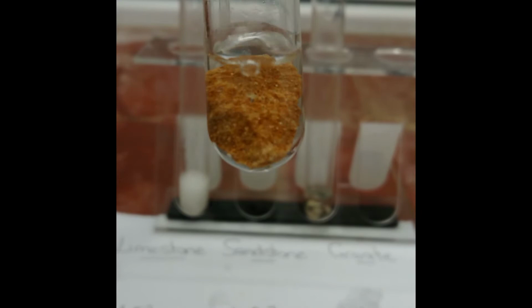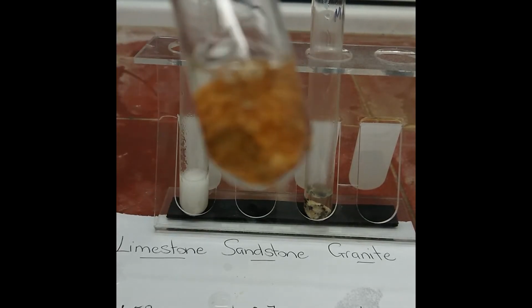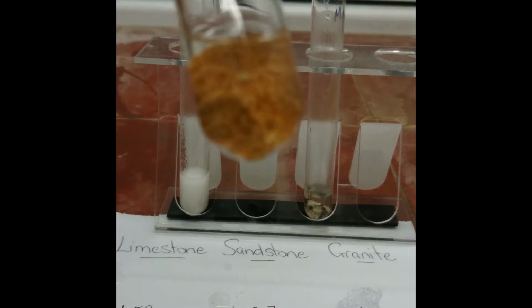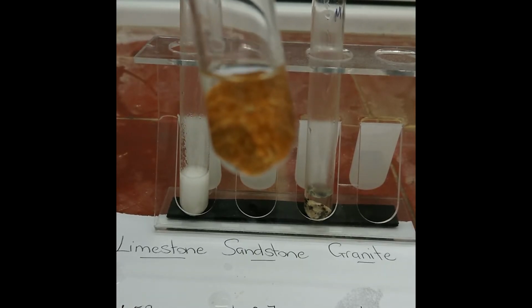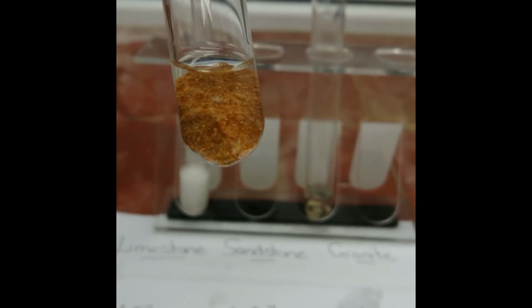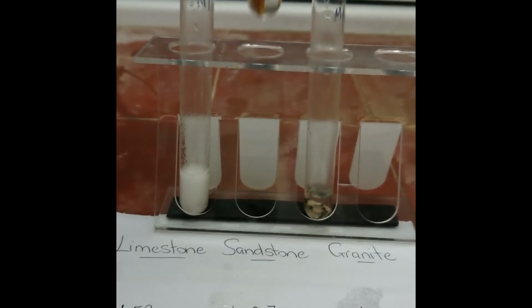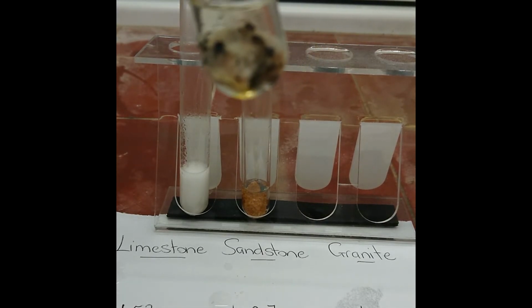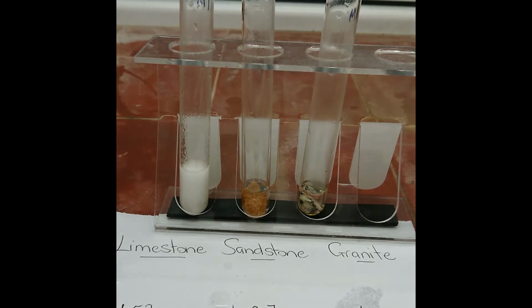We have looked closely at the sandstone. We'll see that there is a small amount of reaction happening. On the granite, there's no reaction at all. Now I'm going to leave this for a little while, and then we'll come back and have a look at it later.